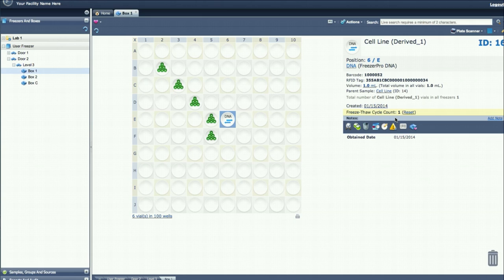One of the last options when working with samples is to add samples to a pick list. Pick lists behave as favorites folders and are a great way to keep track of most of your important samples. It is recommended to keep samples that are used very often grouped into specific pick lists so that you may locate them in the system quickly and easily.